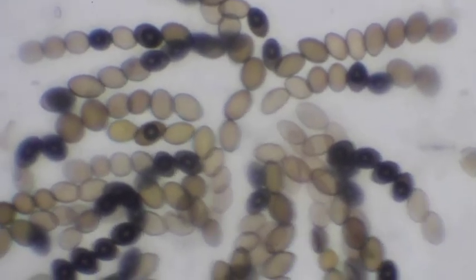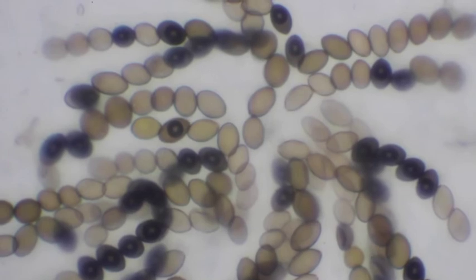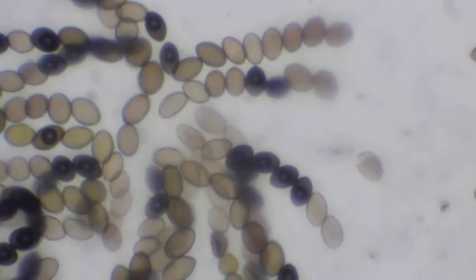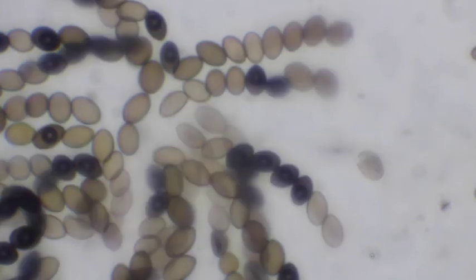You have to be able to get all 8 spores, and they have to be fully developed. But there's one right there. So you can tally that one. Some of these others haven't fully gotten their color yet.